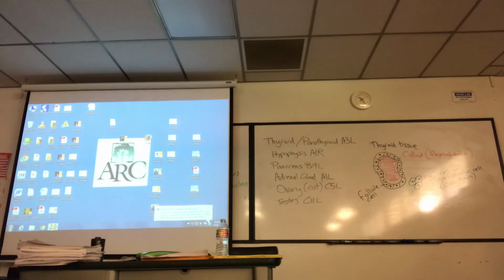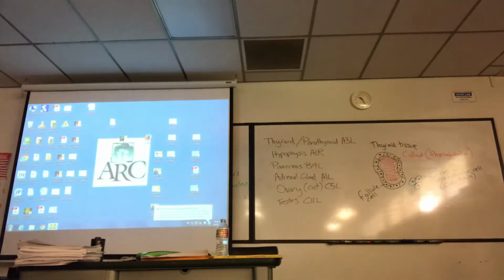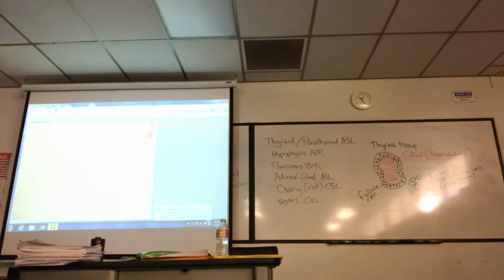You don't have Daniel Slusky for 430? Yeah, a couple people. Yeah, he uses the scope camera too, I think. I use it a lot too for 430 and 431. So that's what I'm using here. It's just an easy way for me to show you our slides, and I can take pictures and we'll use those for the quiz. Let me show you what I see here. The software is called Infinity Analyze. I try to make the picture as clear as I can, but when I take pictures and upload them, you can get a better look.